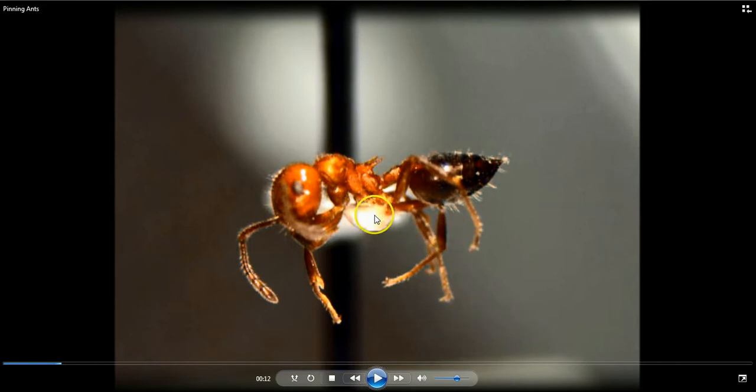Ultimately what you want to do is put the ant on this little point — a little triangular piece of paper. Here's the pin in the background and here's the point of the paper sticking right out at you. We need to be able to see the head, the mesosoma, and the gaster of the ant. Those are the diagnostic areas we need to see.